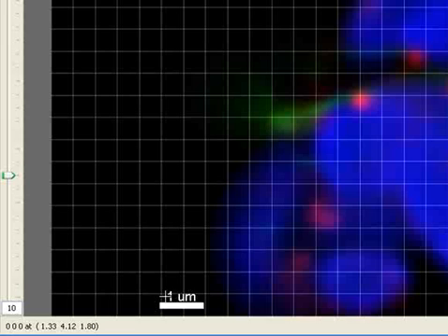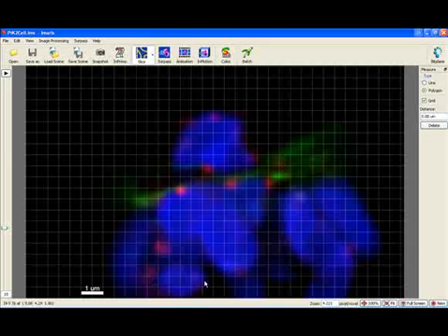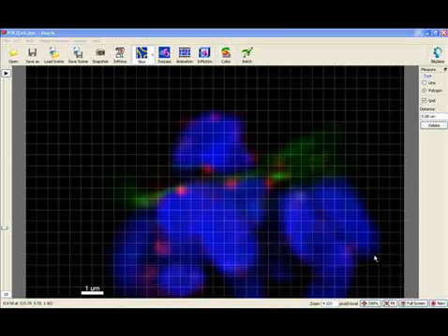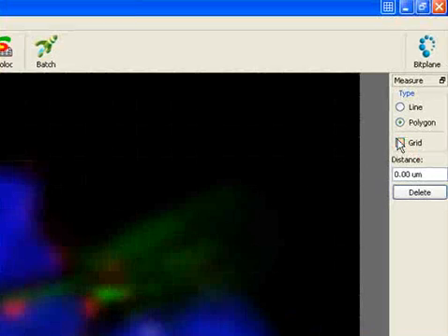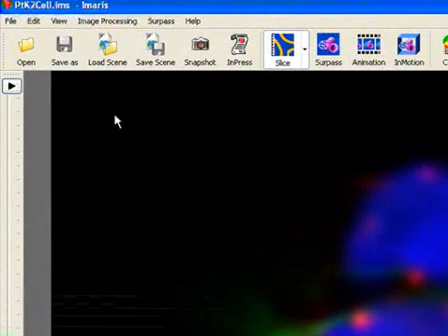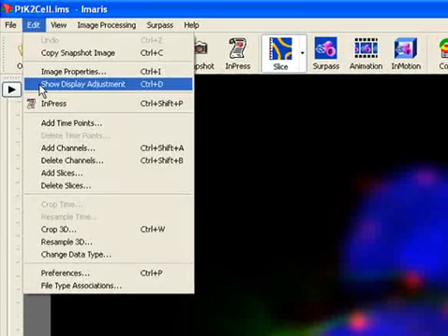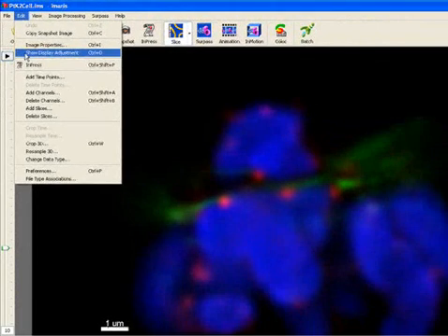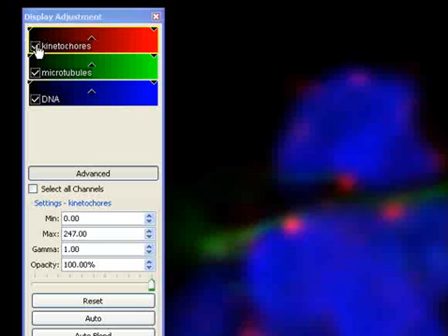Imaris slice view offers the possibility of simple 3D measurements. As an illustration we will measure the length of microtubules between different slices. Start by unselecting the grid option. To focus solely on microtubules open the display adjustment window. Turn off the red and blue channels by unchecking them. In the viewing area only the green channel is now displayed.